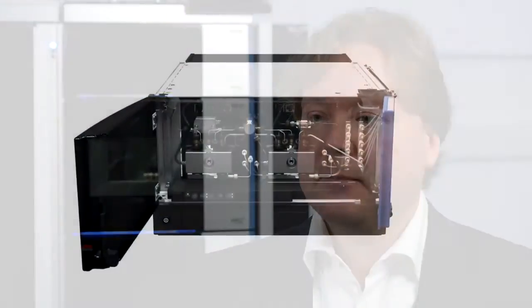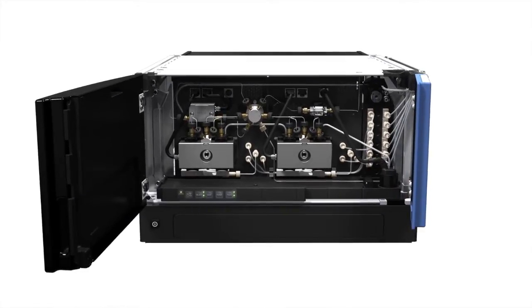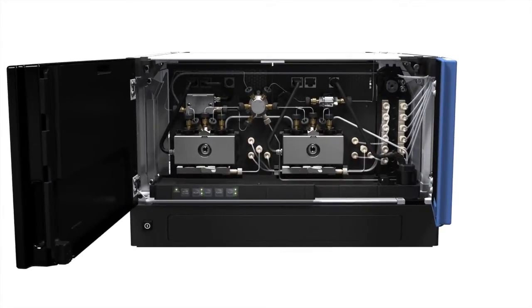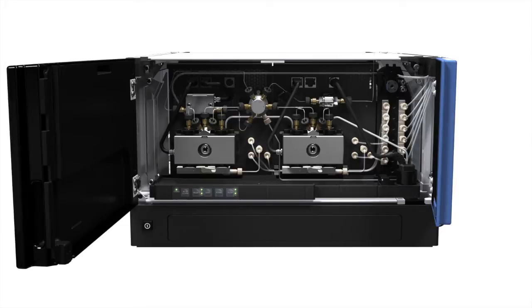If you look at the pump for example, special attention has been put on the materials that are used here. And at the durability of the seals for example, there are specially designed check valves for the pump that are able to cope with all solvents in all combinations.